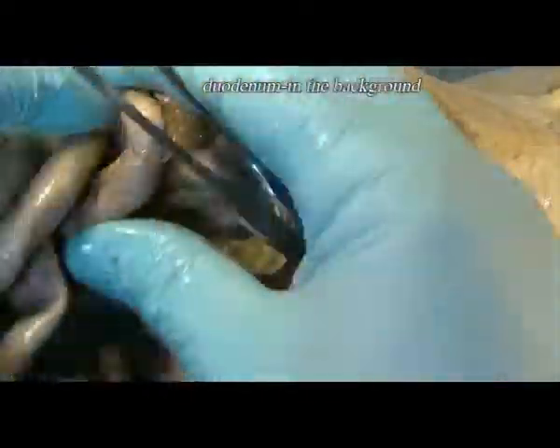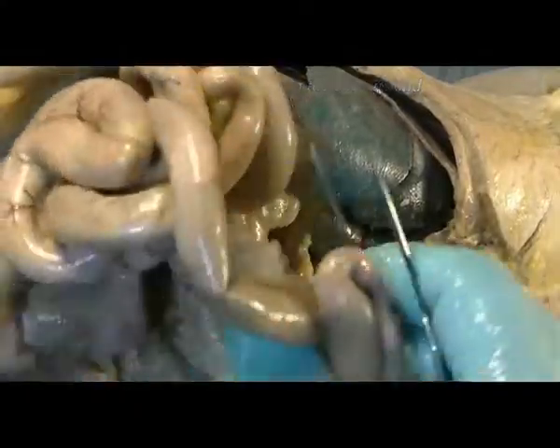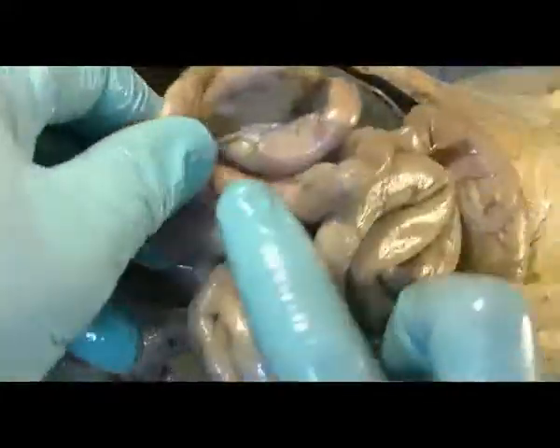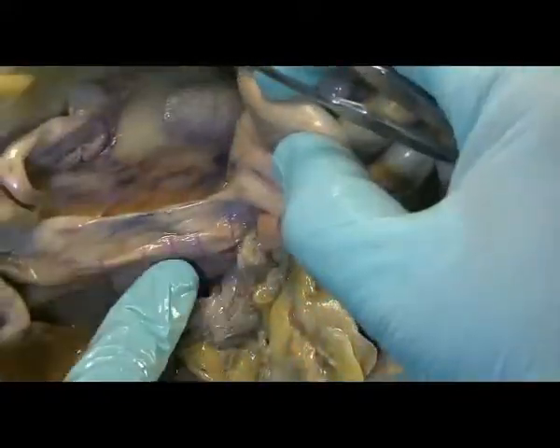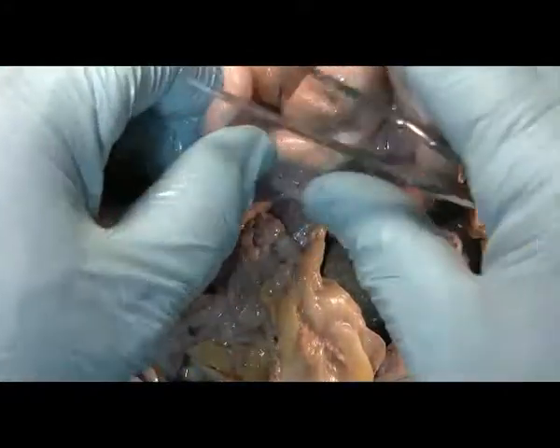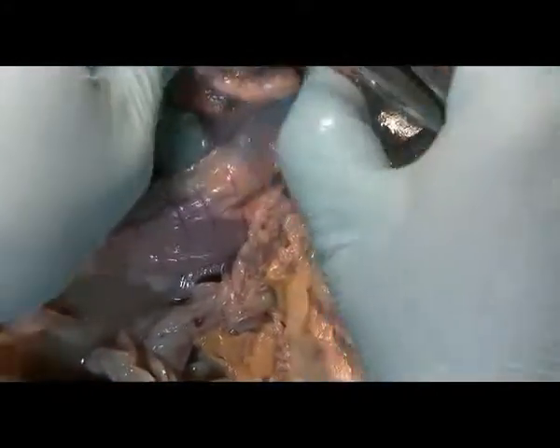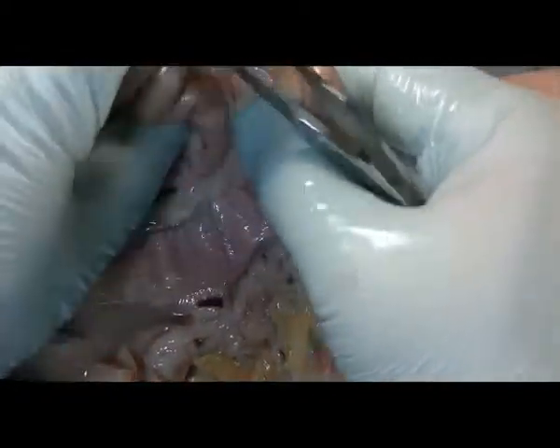Again, you can see the serous membrane, there and there. And if you follow it to its end, I'm going to go backwards a little bit. Here's the colon. And the distal part of the small intestine is the ileum.